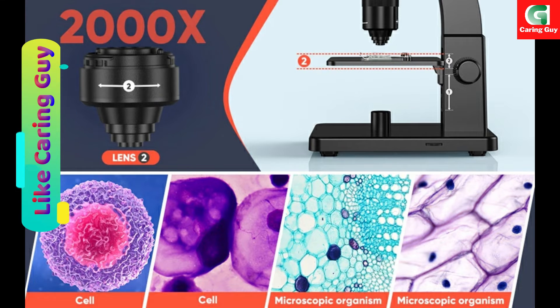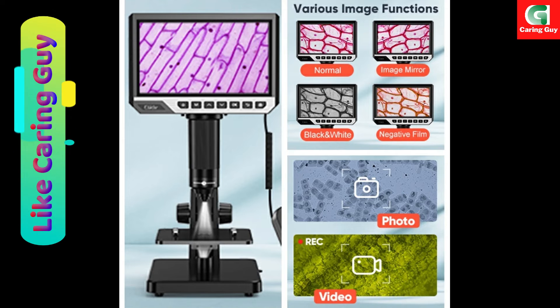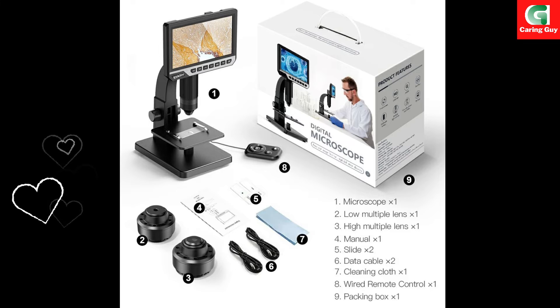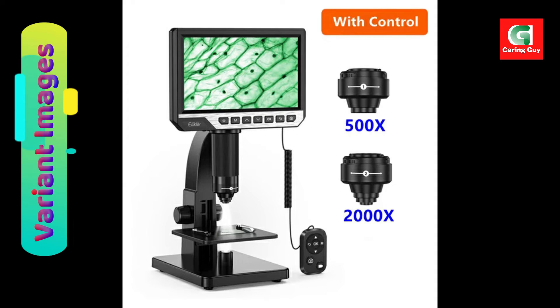The microscope can capture images with a resolution of 4032x3024p and record videos at 1920x1080p. Users can save the images and videos obtained during the observation process to a micro card, and conveniently output them for further analysis or documentation.